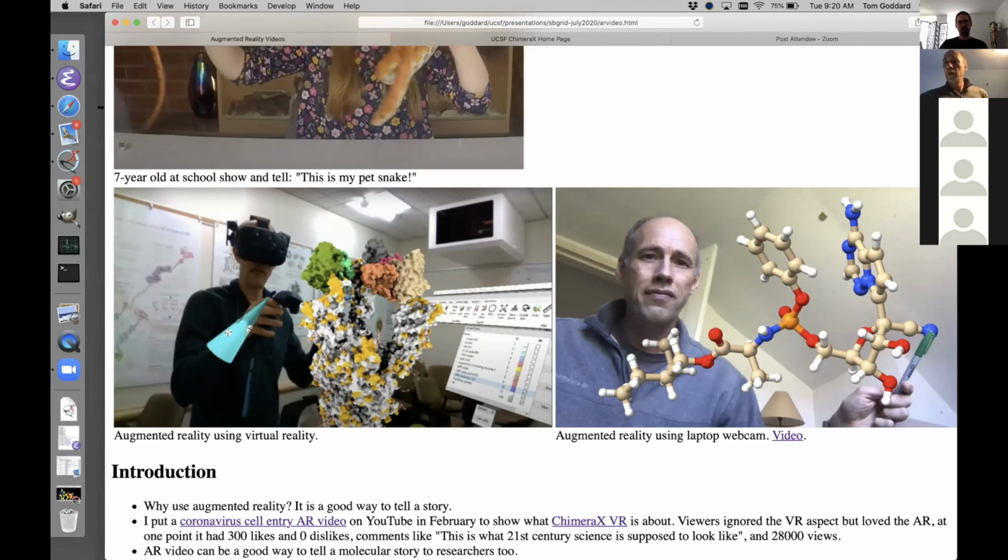And that's important because when I want to combine the video that camera's providing with the molecule, I want to know if my hands are in front or behind the molecule, okay? So I'm using that Intel RealSense depth camera, combining it with the VR. There were 2 commands that I used. I said VR on in ChimeraX, that turned on the VR, and I used RealSense on, which turned on the depth sensing camera. And that was pretty much it.